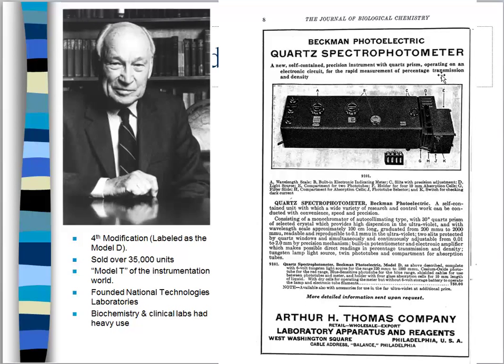So we knew that it worked, but again, years and years of improvement have led us to better equipment with better data analysis, and transmission is not used anymore for the measurement purposes of a spectrometer. So you can go on down and take a look at the advertisement.